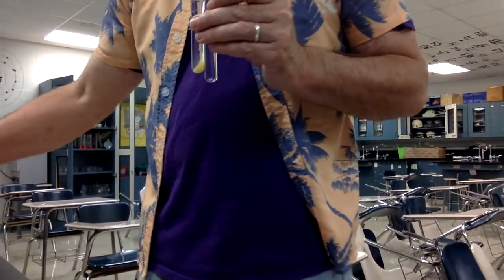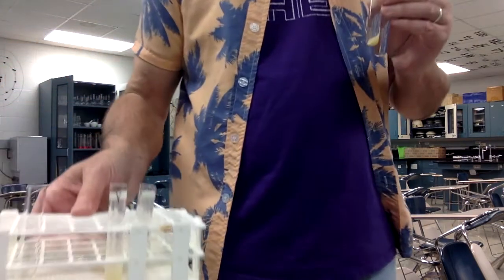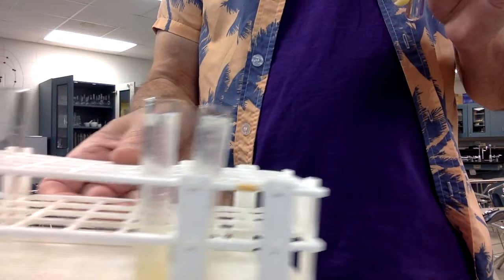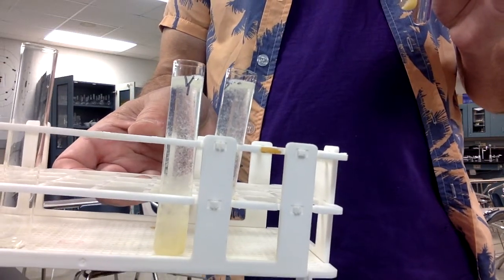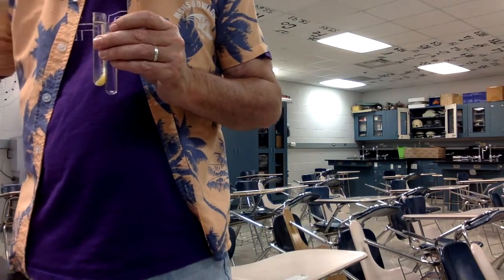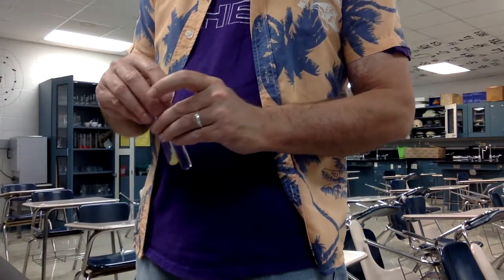Back over here on our workstation, while that was centrifuging, I was doing the samples for the yellow and the brown banana. So we will centrifuge those opposite each other since they have the same amount of liquid in them. I can put those two opposite of each other.